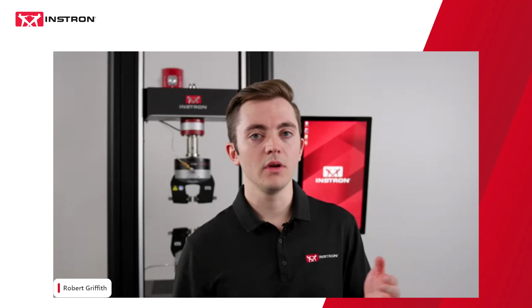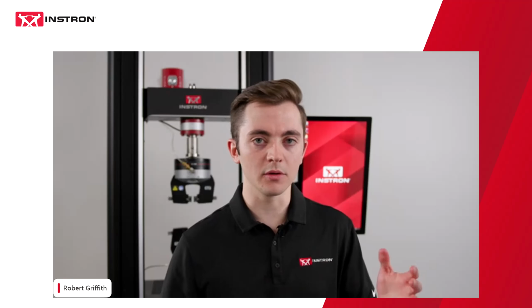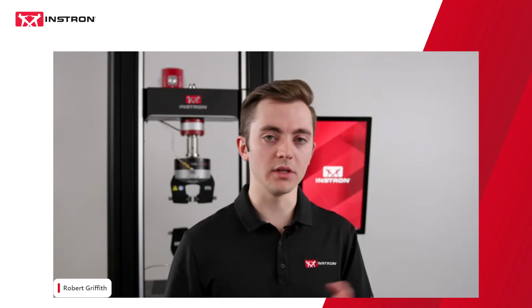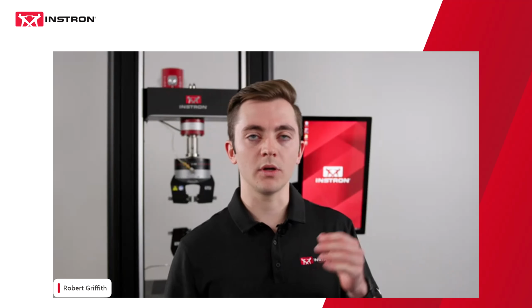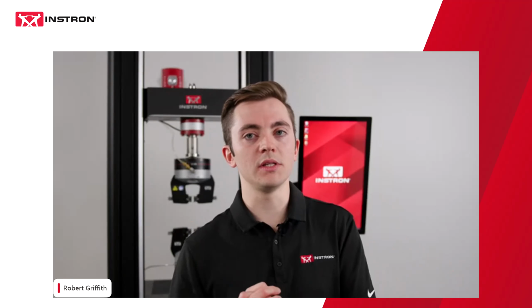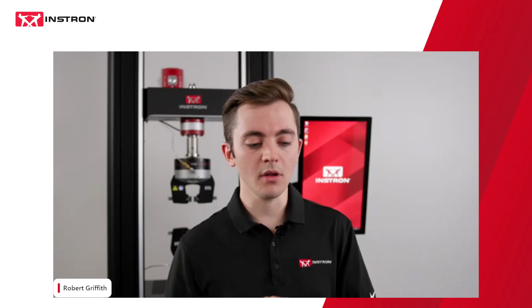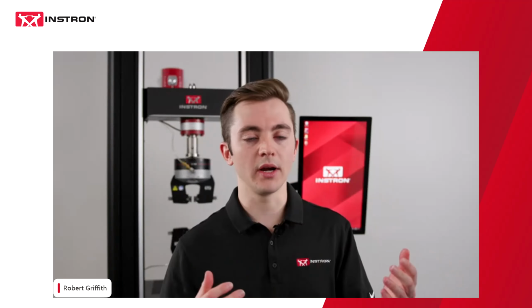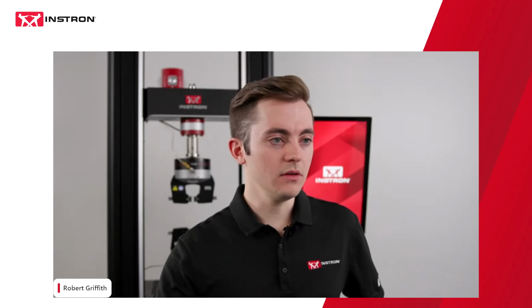Today I wanted to go through some information about Bluehill Central, which is the latest software platform or tool that Instron has released back in early 2022. So I have a couple slides I'm going to share with everyone to cover some high-level concepts associated with the software, but the bulk of today's webinar is going to be spent actually in the software going through some example workflows of the most common things that customers have done in the software and some of its common use cases. So I'm going to share my screen.